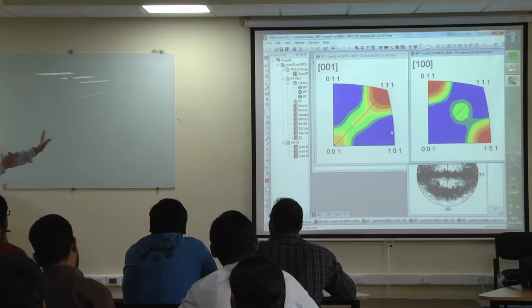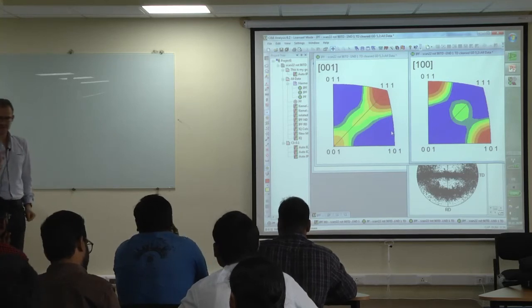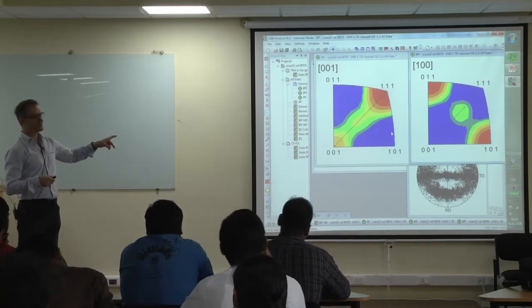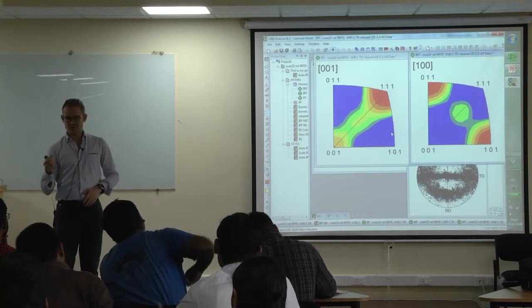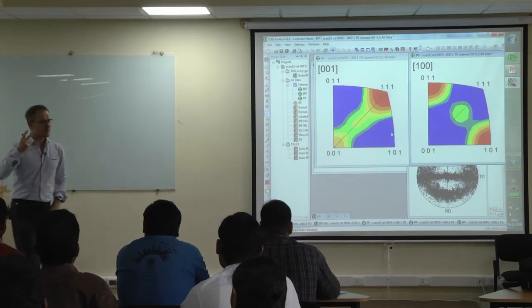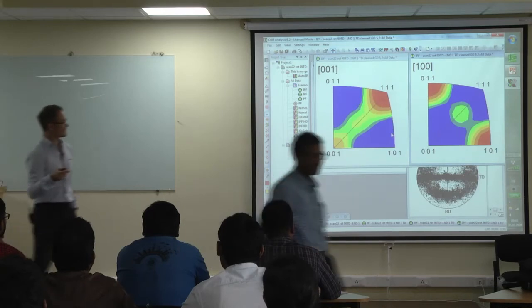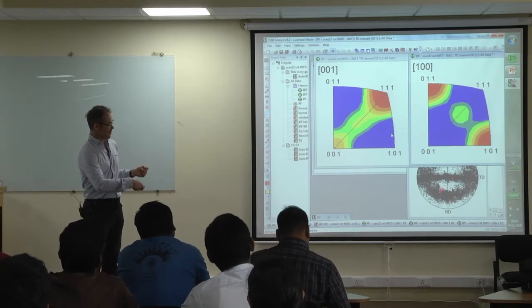Shortly, because we just have it on the screen, I should maybe shortly repeat what we see here. When you have these inverse pole figures, once again, what you display there is in which crystallographic directions point certain sample directions. So we are looking for features in the sample which are related, of course that's what we always search, to certain crystallographic directions. And this is very often more easily visible in an inverse pole figure than in a normal pole figure.